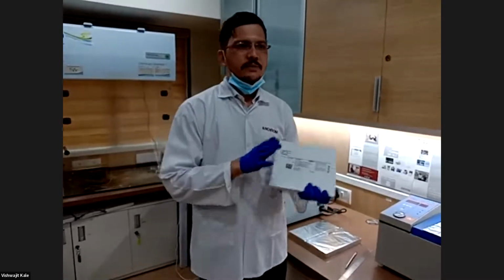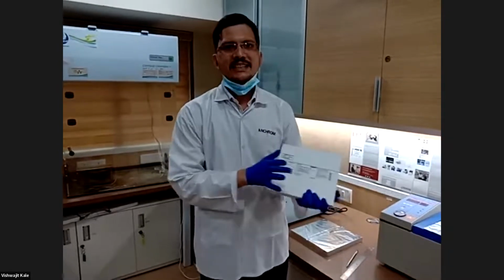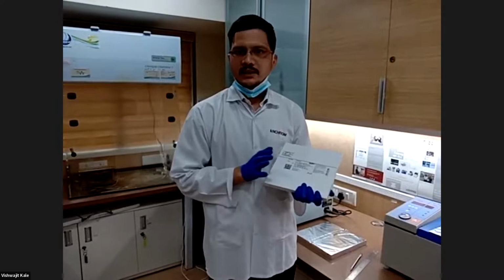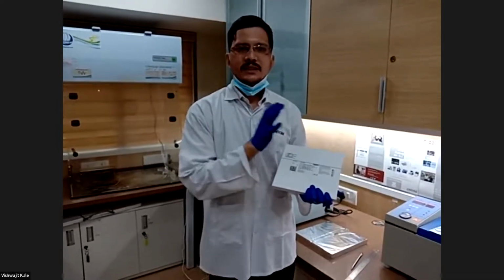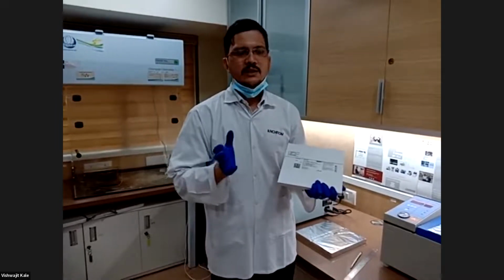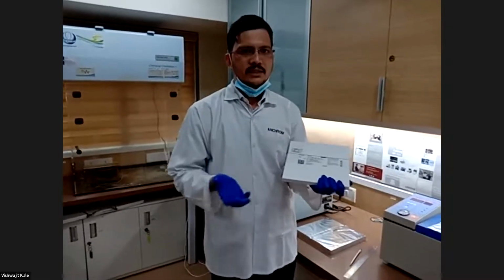But most of the time HPTLC is done on normal phase plates, that is TLC or HPTLC plates, having 5 microns to 10 microns particle size. So as per the sensitivity of analysis of interest, we can select a 10 microns particle size plate or a 5 microns particle size plate for better resolution.